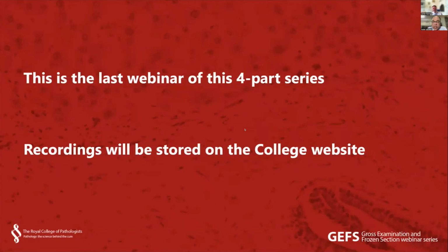Sure. And any tip regarding which solution you would want to use? Because that's one of the questions following up later on. Well, we don't use it. I mean, one of our biomedical scientists who used to work here did a project a long time ago looking at the use of fat clearing techniques, and they used that. I think is it called GEWF or GWEF? We wrote a paper on it, actually. It was in the Journal of Clinical Pathology.